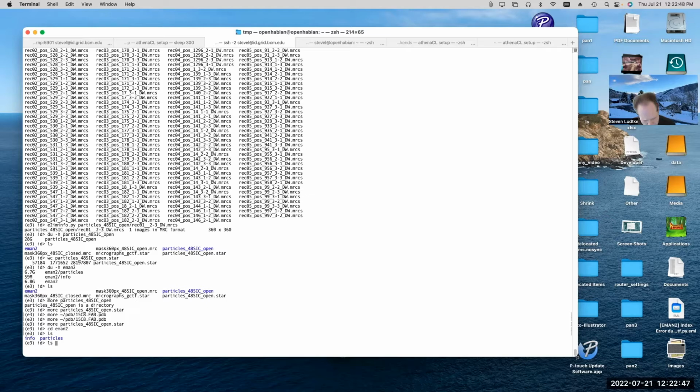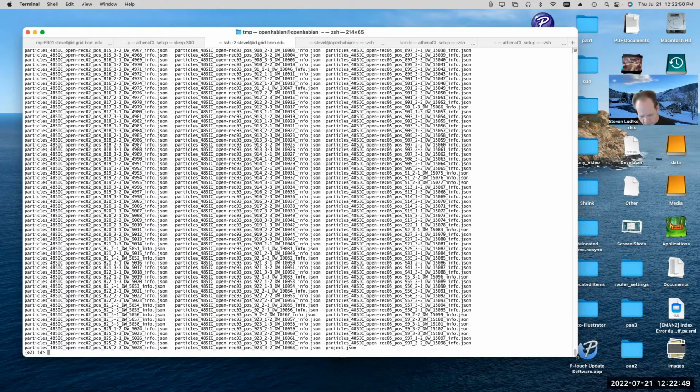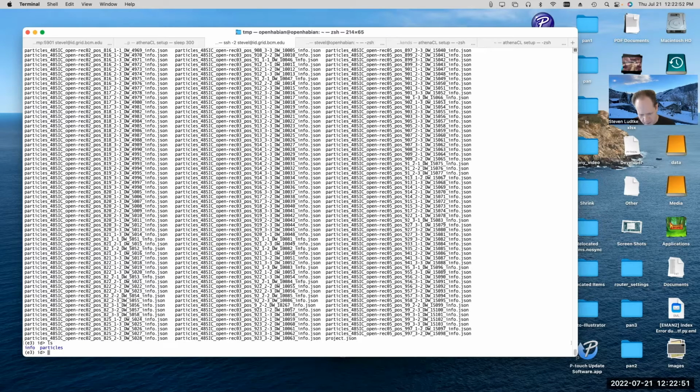Let's see. So if you look in an EMAN2 project, and I'll explain how we generated this: if you import a Relion project into EMAN2, what you'll wind up with is a folder called particles and a folder called info.